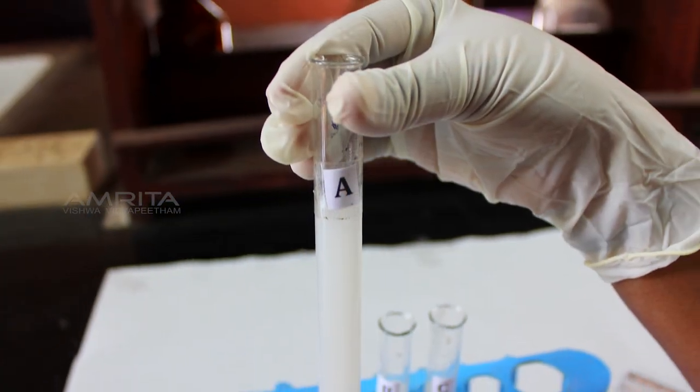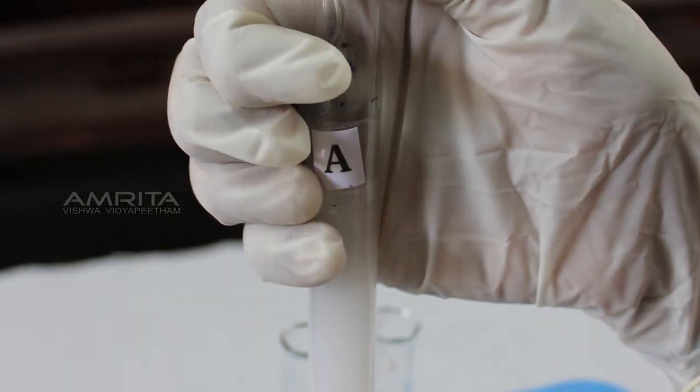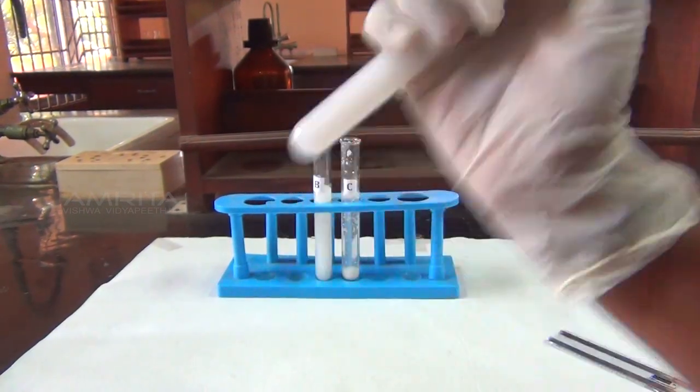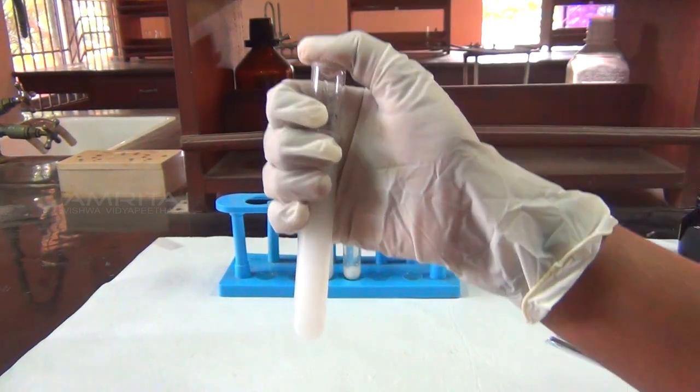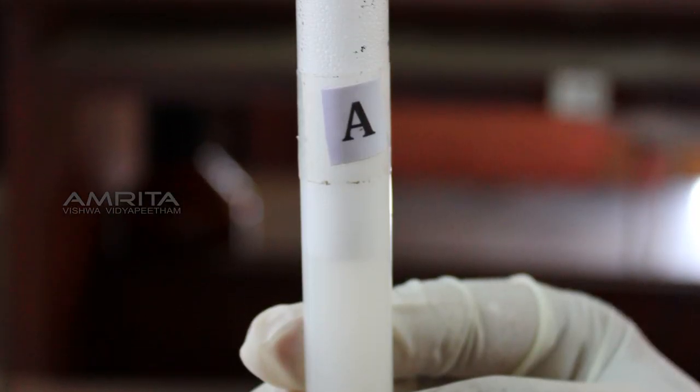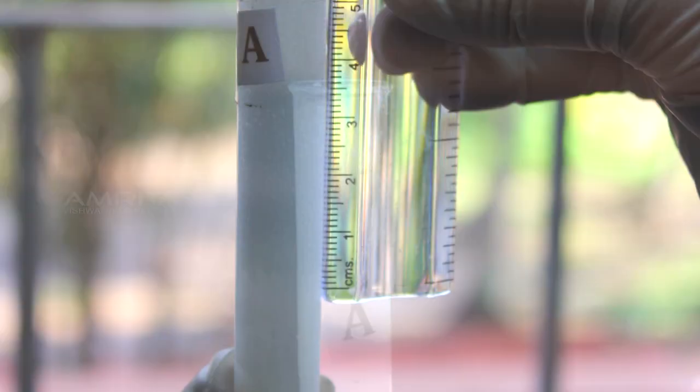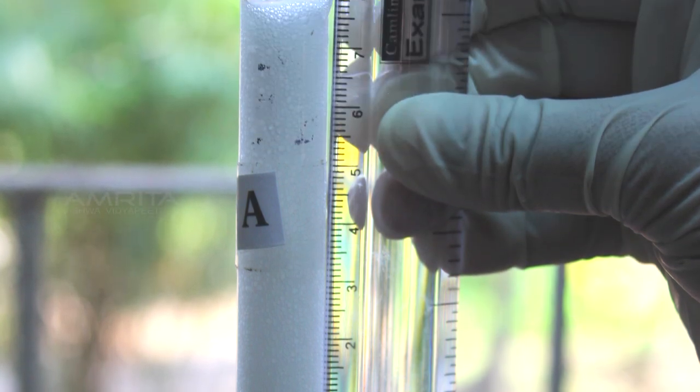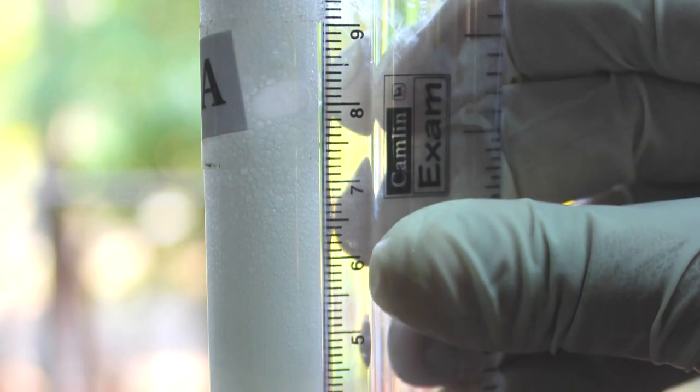Hold test tube A by hand, closing its mouth with the thumb. Shake it thoroughly 10 times upwards and downwards. You will notice that lather or foam has formed in the test tube. Measure the length of the foam and the final length of the soap solution using the measuring scale.